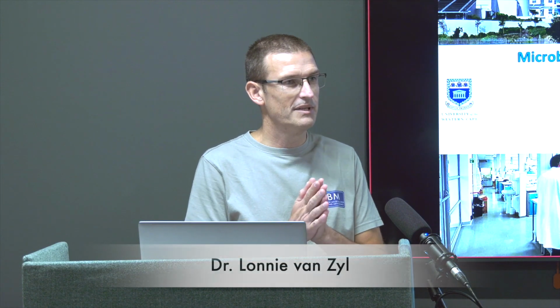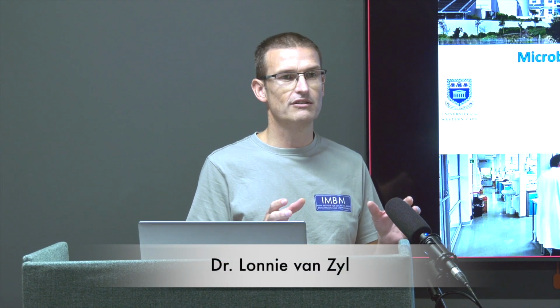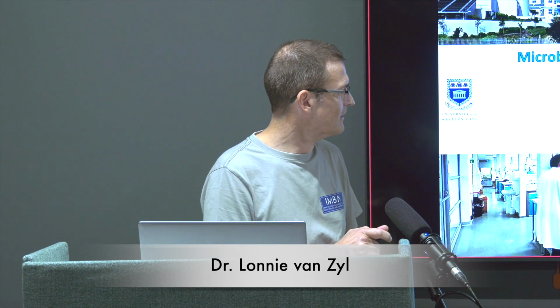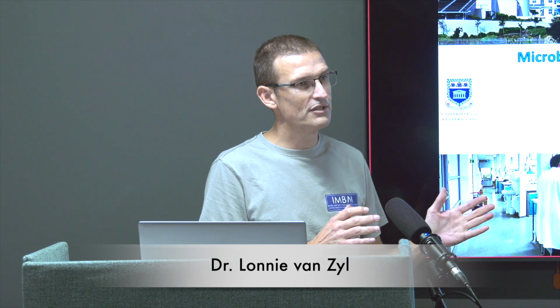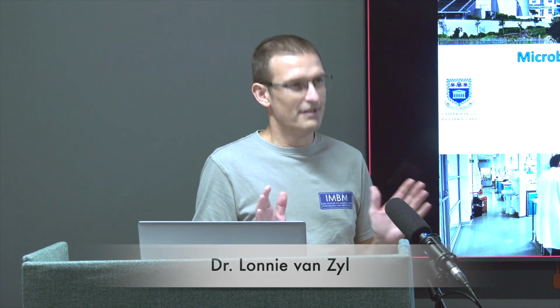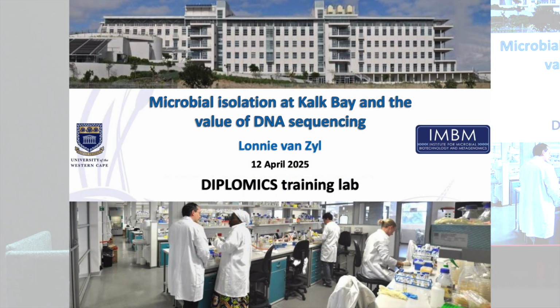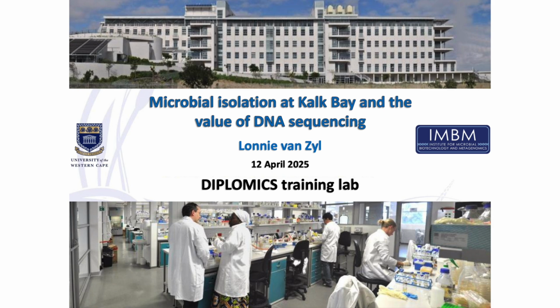So my little talk today is going to be telling you guys about isolation of bacteria that we've done recently at Kalk Bay. And then I'm going to give a super short crash course in Oxford Nanopore sequencing. So hopefully you guys can hang in there. This stuff is way more complicated than I'm going to tell you about.